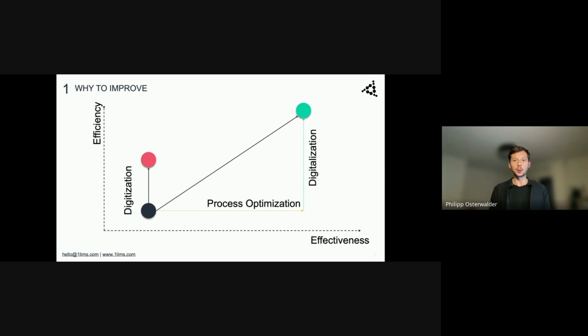And what do we do with this spare time that we gain through this process optimization and then digitalization of the laboratory and quality workflows?